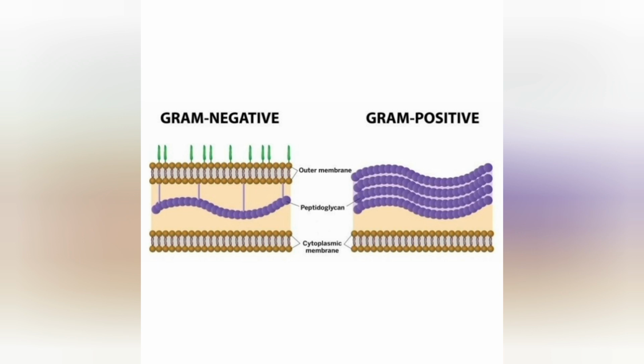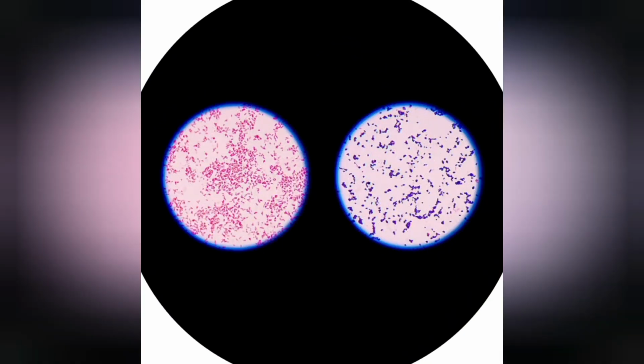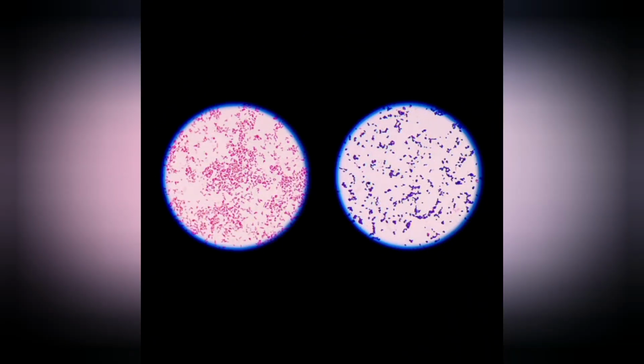In order for the bacteria to retain gram stain, it must have a thick peptidoglycan layer, and that is exactly what gram-positive bacteria have. And that's why it stains as crystal violet. However, bacteria with thin peptidoglycan layer, like gram-negative bacteria, turn red or pink with counterstain. You might wonder what counterstain we use. Basic fuchsin stain is abundantly used, but sometimes we use safranin as well.